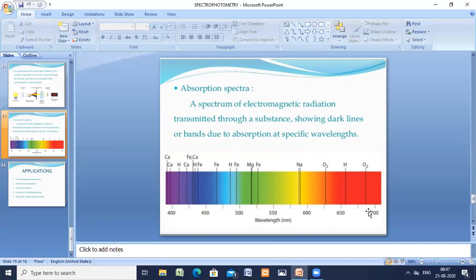Generally, I'm going to explain the different regions. Ultraviolet region is 150 to 400 nanometers, not shown here. Only the visible region is shown for us. In the ultraviolet region, from 150 to 400, molecules give the spectrum using pi, n and sigma electrons. The visible region is 400 to 800 nanometers. There also you get the spectrum based on molecules containing pi, sigma and n electrons.